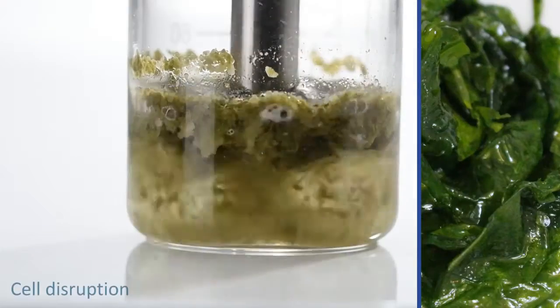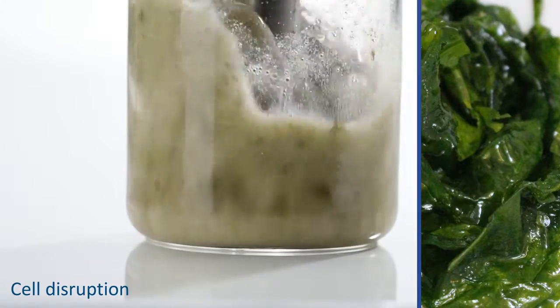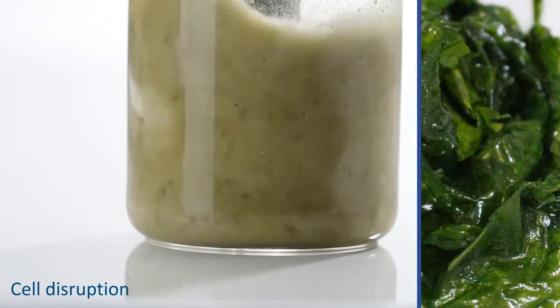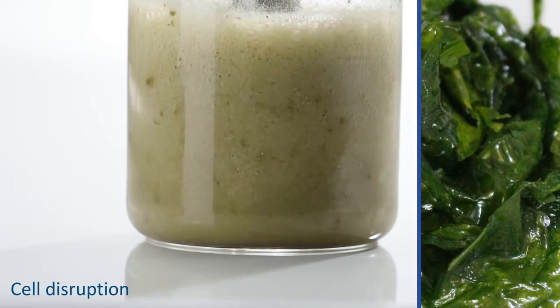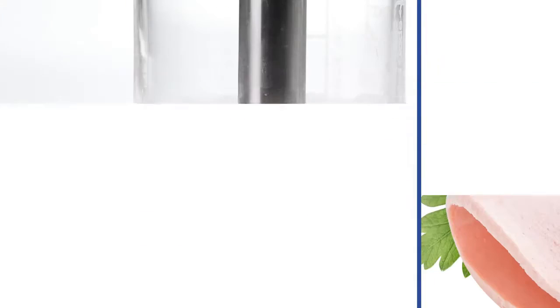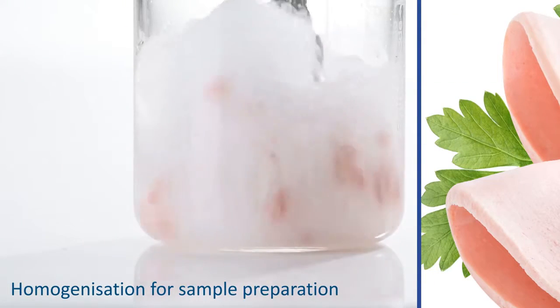Every day laboratory work involves many materials that need to be homogenized, de-agglomerated, degassed, or solubilized. These include bacteria, yeasts, fungi, algae, and especially microalgae. There is, however, only one technique that can be used to carry out these processes in a quick, simple, flexible way that delivers the best quality.